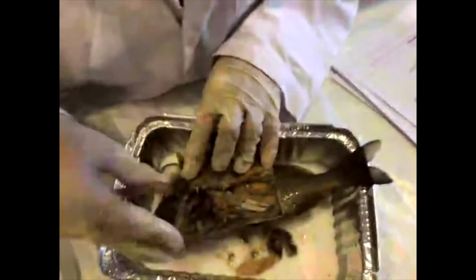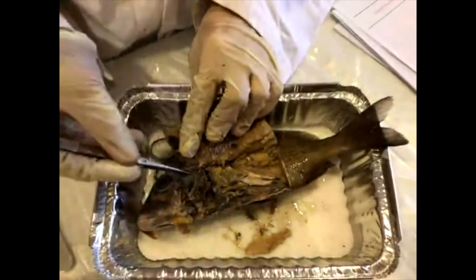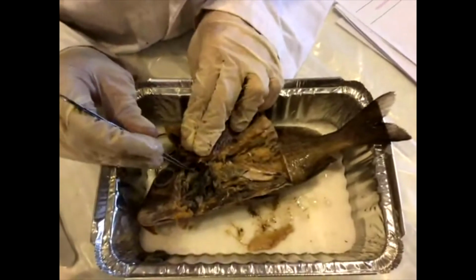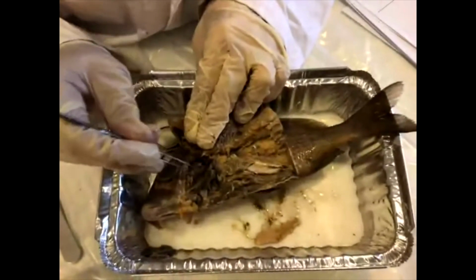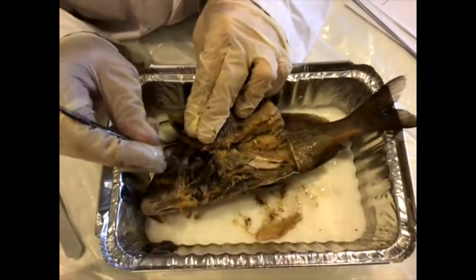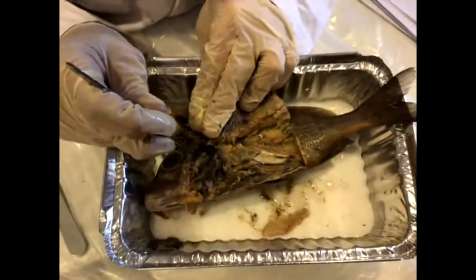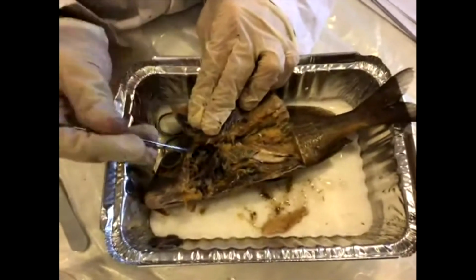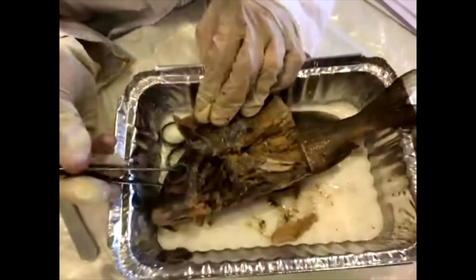All right, so I'm going to lay this back down so maybe you can get oriented again where we are. So our gills were here, and then we removed them. And underneath, we've got our heart nestled right in here. Now, our heart doesn't look like the heart shape that you would see. It looks kind of more like a circle. But if you were going to draw it, you could draw a lobe like this and then a smaller lobe like this coming off. And that would indicate that it's got those two different chambers, one for oxygenating the blood and then one for pushing the oxygen-rich blood through to the rest of the body.